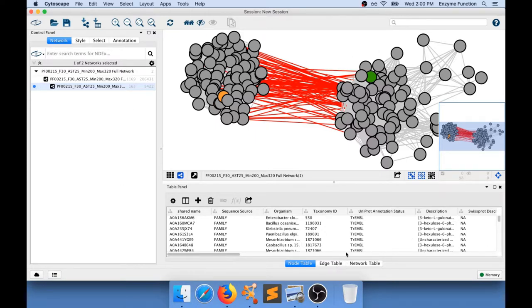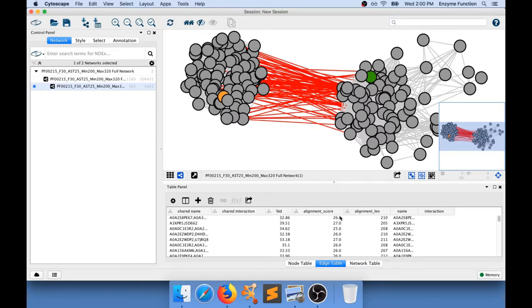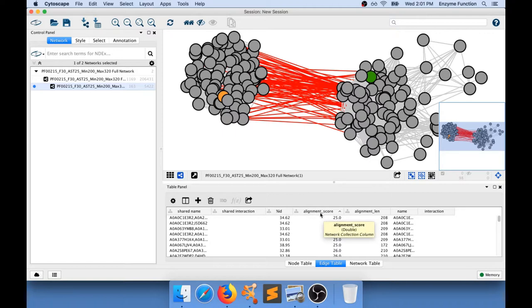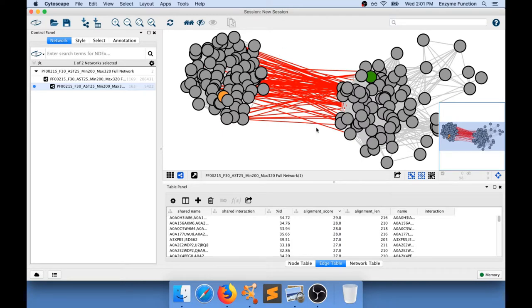And I need to go now to the edge table and I'm going to see in here that I can see the value in the alignment score unit for all those edges. And I can sort by clicking on the header for that column. And I can see that the lowest value is 25. That's because when I generated my network I used an alignment score threshold of 25. But what I am interested in is actually what is the highest value that connects these two clusters. And I can see that the maximum alignment score that I can find in here is actually 29.